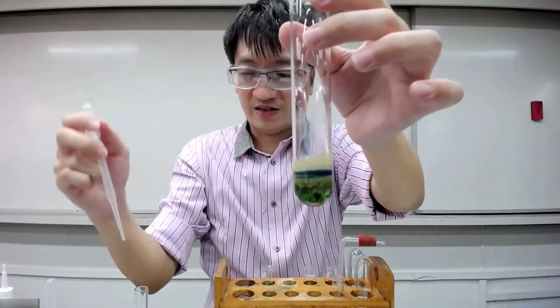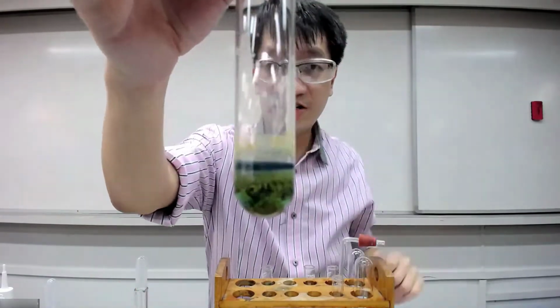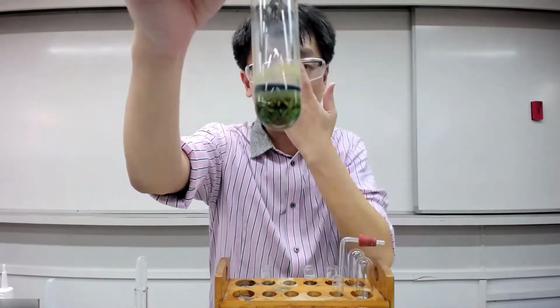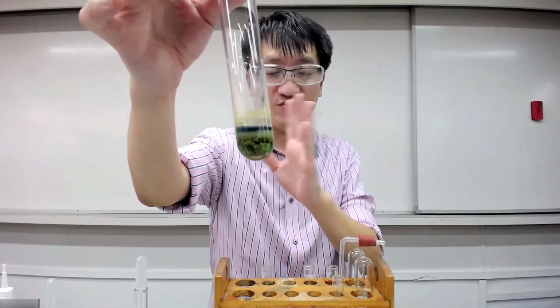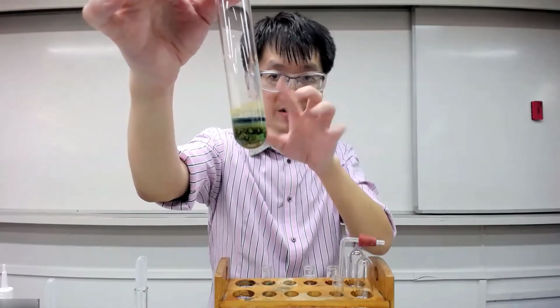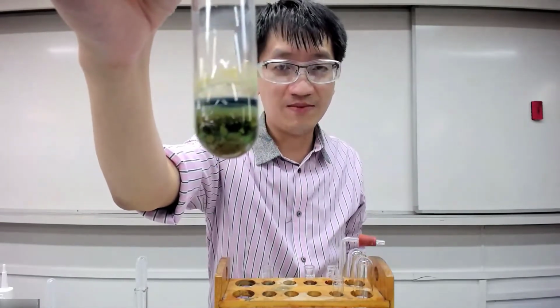Okay, can you see over here? There's a rim of dark blue solution. So it does give you a clue already. Confirm it contains copper 2, right? Because if not, you wouldn't get the dark blue complex. The reddish brown thing floating around, I don't know what they are, probably some iron.